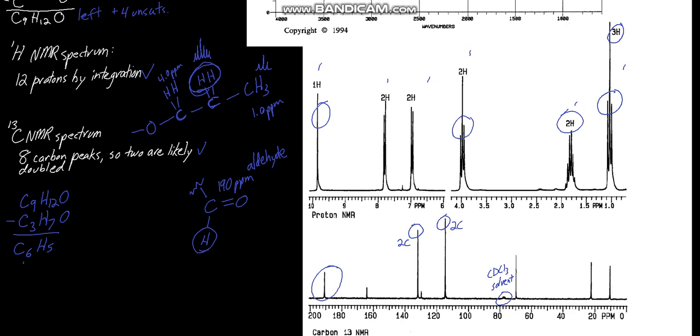That hydrogen can be subtracted, minus a hydrogen, leaves us with C6H4. And remember, we still have 4 unsaturations left to account for. Those unsaturations are likely associated with the only signals we have left, and these are in the aromatic region. Could be alkenes, but most likely 7 to 8 ppm aromatic ring, benzene type aromatic ring, very common in nature, is a good first guess. That's 4 unsaturations.